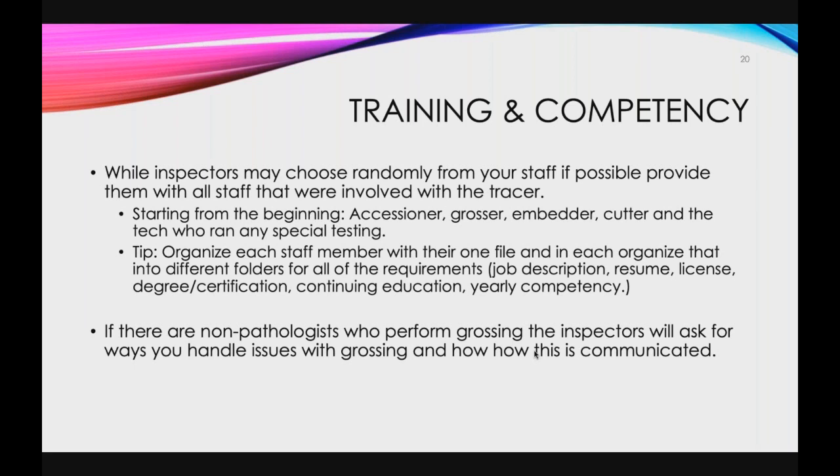So you always want to give, and they may ask you for 1 or 2 cases. It depends on what kind of case you give them. If you give them a case that has all of these different areas, from a frozen section to special stains or immunostains, all of that together, they may not ask for all of it. But start at the beginning.